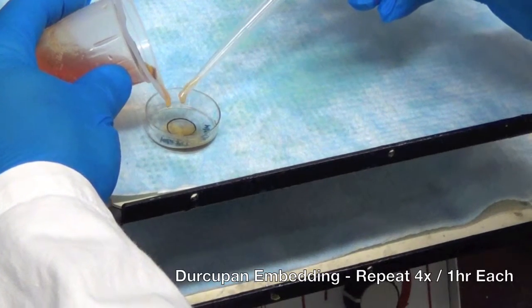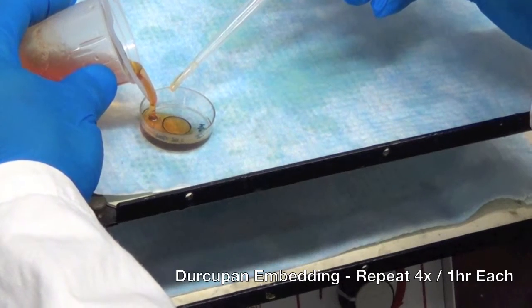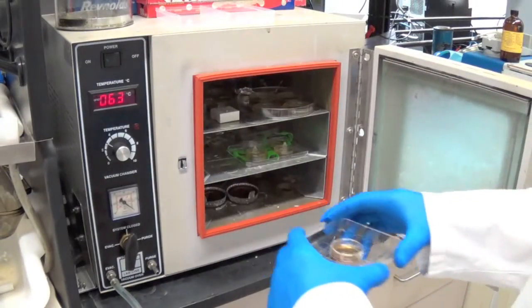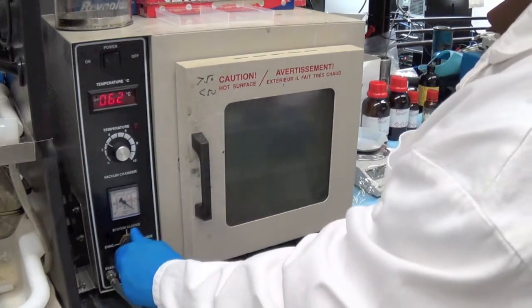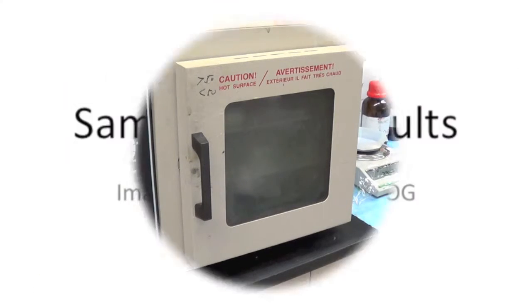Afterwards, replace with 100% Durcupan. Scrape out and replace the Durcupan 3 more times, at least 1 hour each, making 4 resin changes in total. Finally, bake your sample in a 60 degrees Celsius oven for at least 48 hours. Your sample is now ready for sectioning, and then imaging with your transmission electron microscope.